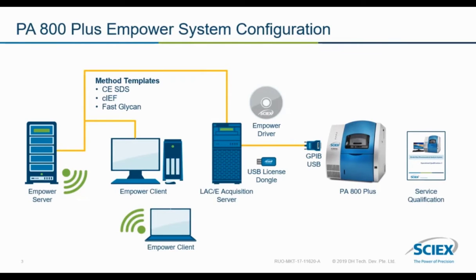system configuration to allow flexibility in using either the older GPIB USB HS or the newer GPIB USB HS Plus. This eliminates the need for users to upgrade to the newer HS Plus version. This addresses some of the incompatibility issues associated with the previous driver version 1.2.1.